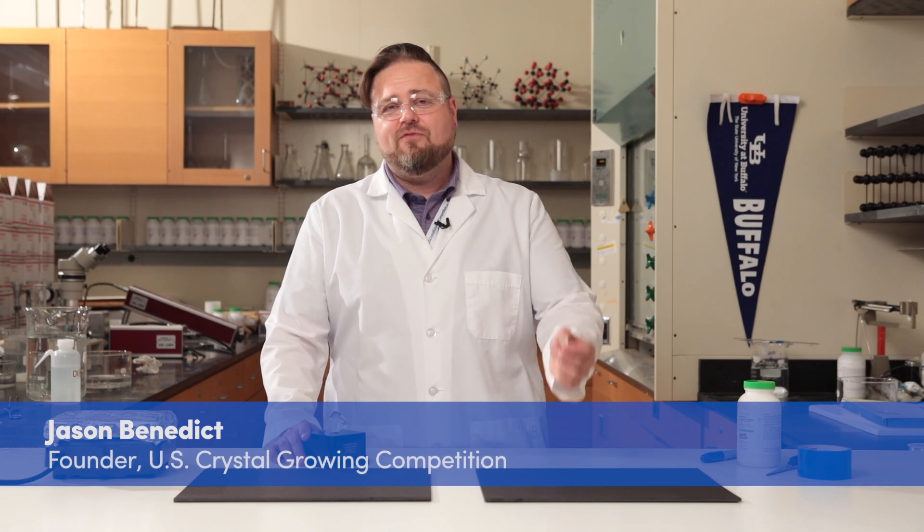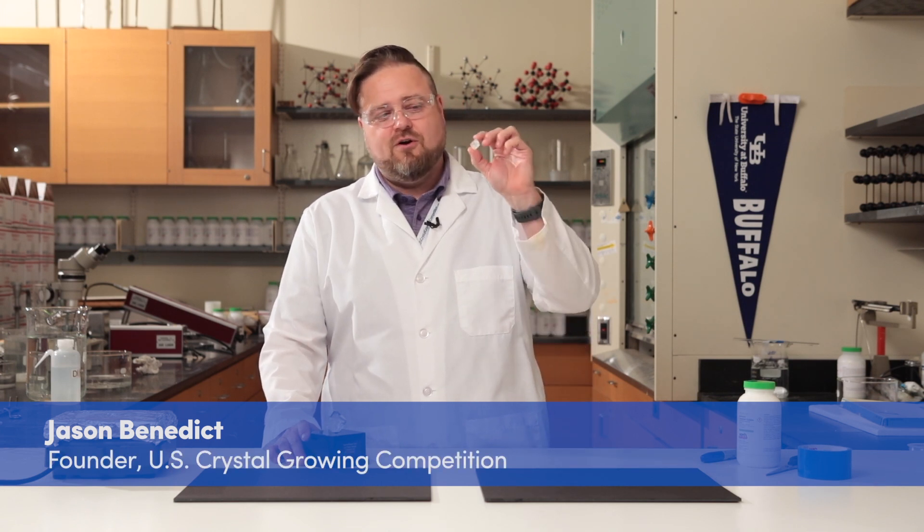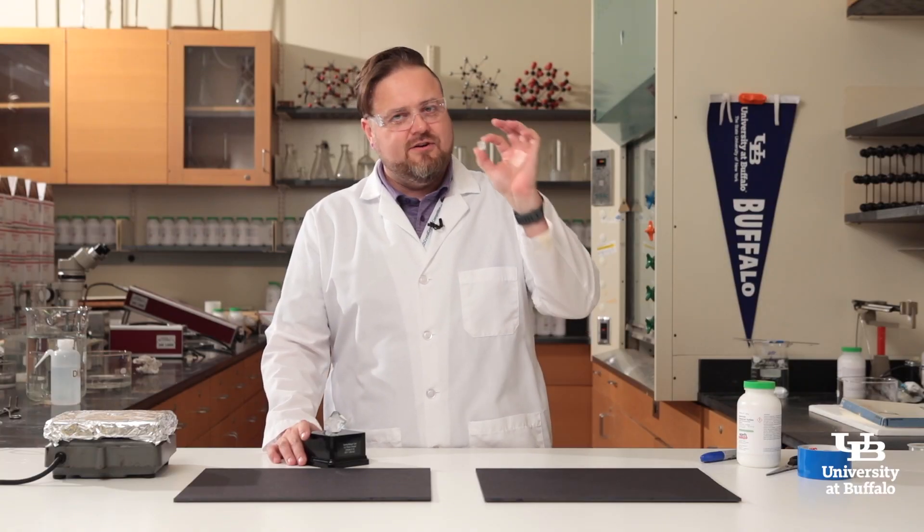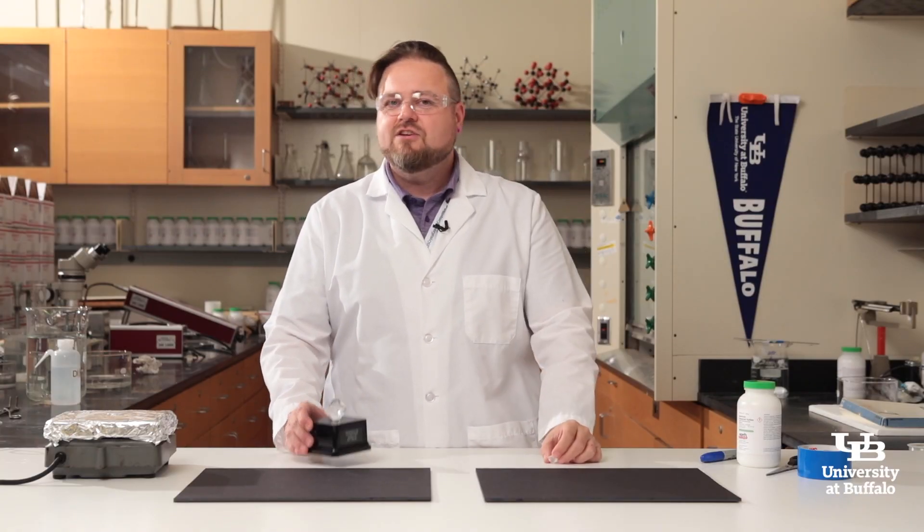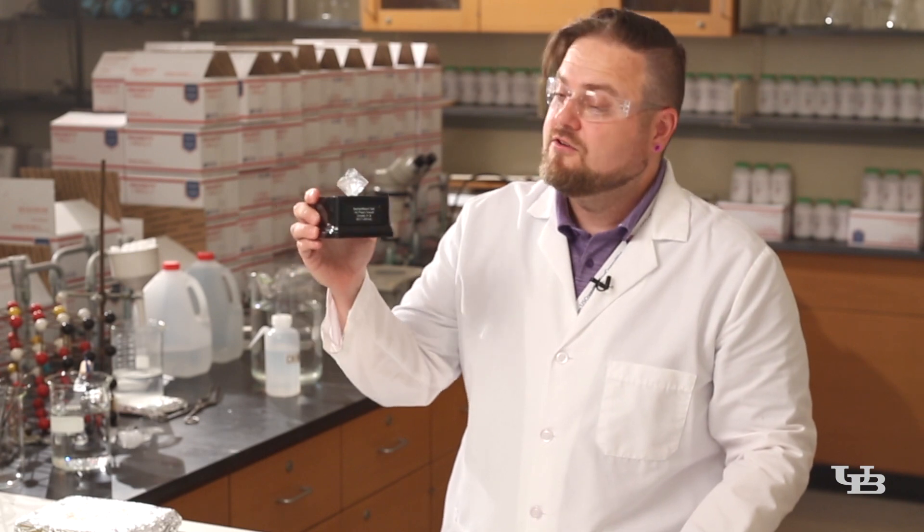This is the second video in a two-part series on how to grow a large single crystal. In the first video we showed you how to grow a seed crystal. The second video is going to show you how to turn this seed crystal into a large single crystal.